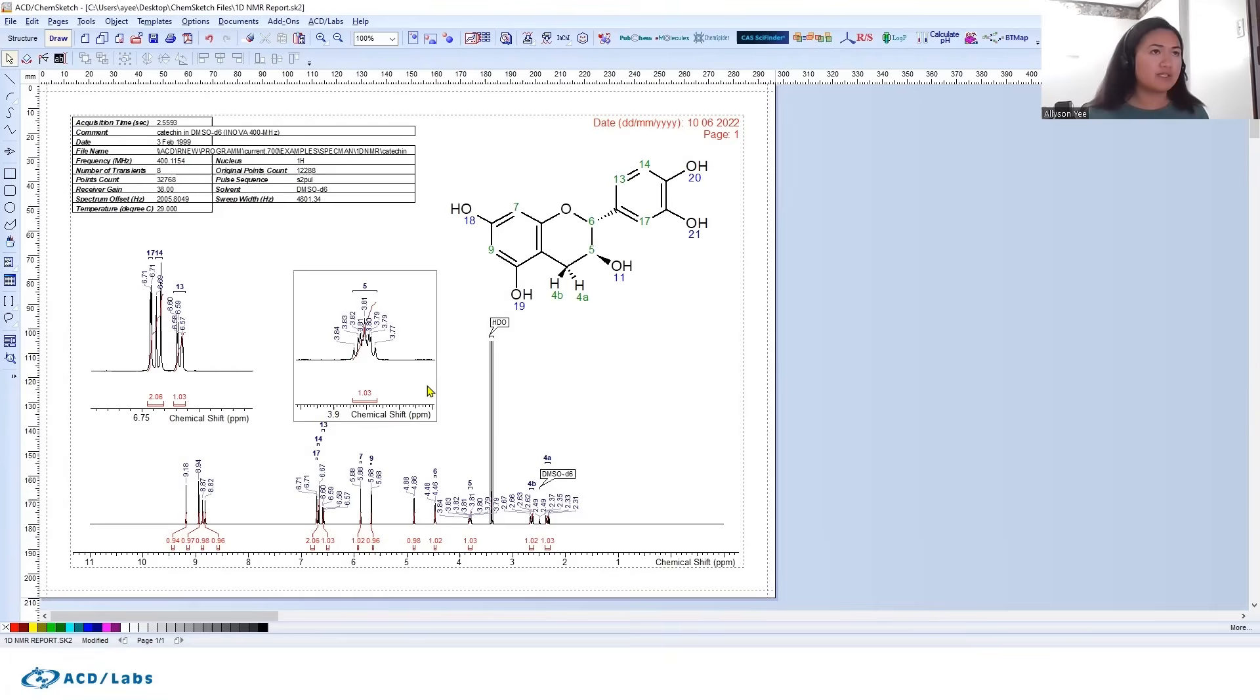You can very clearly see this multiplet, you can see the way it's being split, and you still have the chemical shift and area shown right below it. That's something we find that a lot of people like in reporting with ChemSketch.